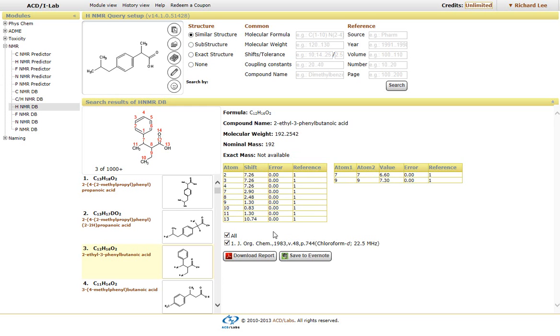And again, it gives you also the journal, and you have the ability to download the report from the website, either as a PDF or save as an Evernote file.